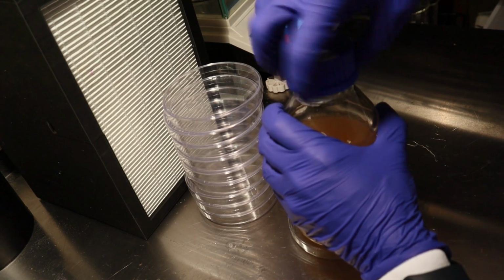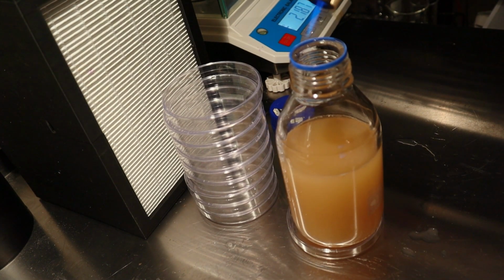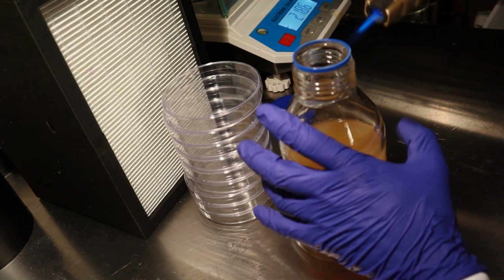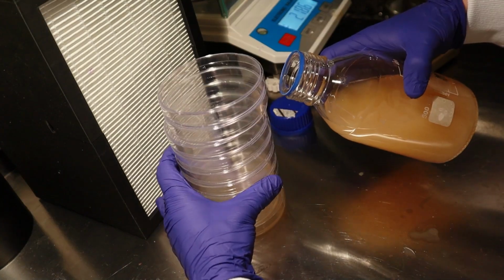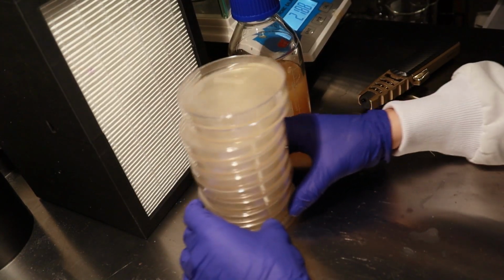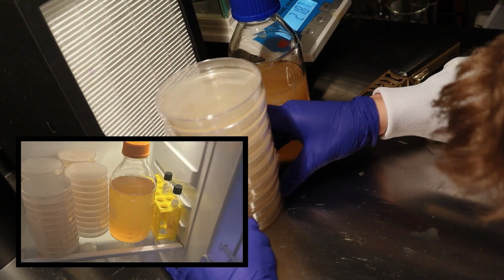I then turned on the hood and opened my bottle in front of it. And I used a tiny blowtorch to sterilize the pour ring and lower area, swirling the bottle gently to suspend the calcium carbonate stuck to the bottom. I then carefully poured each plate around halfway in the stack and then swirled them all at once. Once they were all done, I let them cool and put them in the fridge for later. Now I could finally begin the project as everything was prepared.